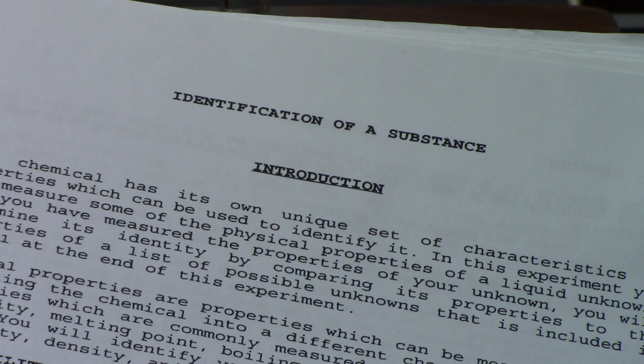All right. If it doesn't dissolve, there will be a clear separation, just like oil and water, and that will be called insoluble. And that'll be a heterogeneous mixture. The third possibility is sort of a mix between the two, where it looks soluble when you mix the two, but when you shake it up, you can see that there's particles that seem to be insoluble. So we say it's slightly soluble or slightly insoluble. So we're going to do that test first.